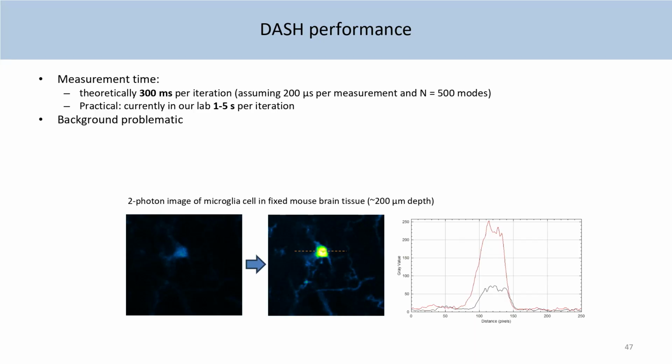So you've seen this was maybe 4 seconds to go 3 iterations. We are not pushing it. At the moment, we are measuring the PMT signal, going to the PC, calculating the new pattern in LabVIEW, sending it to the PCI Express card of our mirror, and then it goes to the mirror. So we are measuring actually only at 1 kilohertz.